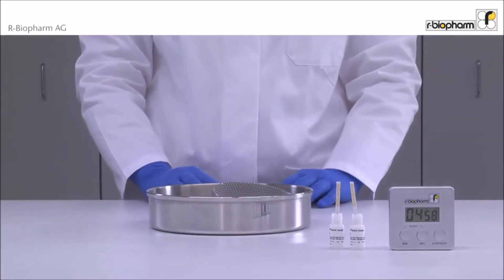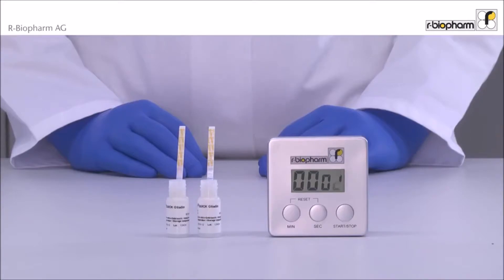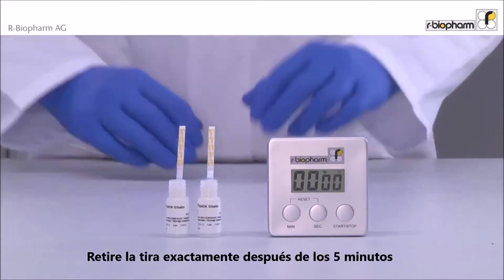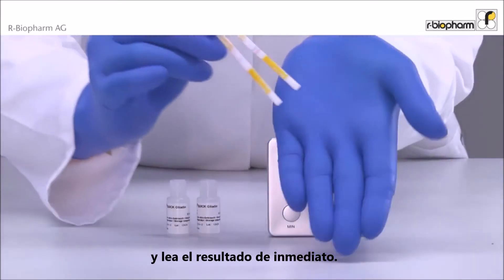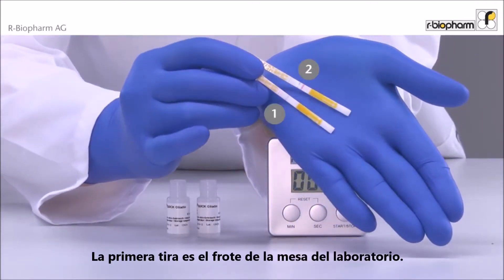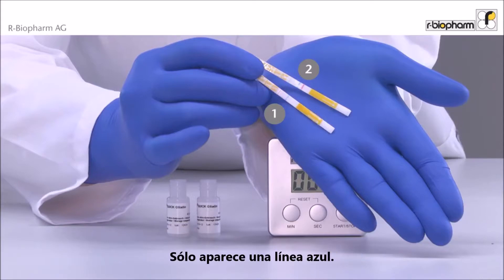Incubate for 5 minutes. Take out the strip exactly after 5 minutes and read the results immediately. The first swab sample is from the lab bench — it shows only a blue band. The result is clearly negative.